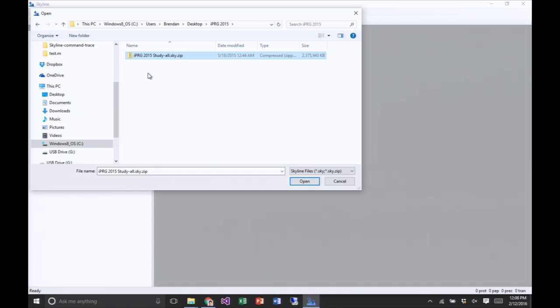What? You're finished? Okay. So you want to get to the point where you have this IPRG 2015 study all.sky.zip file selected. Anybody who's got it selected can go ahead and click open. I'll leave it here for the people who aren't totally with me.